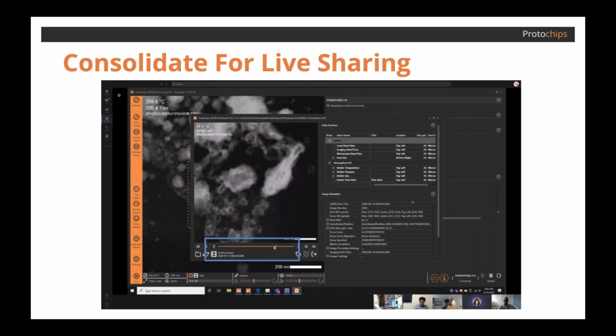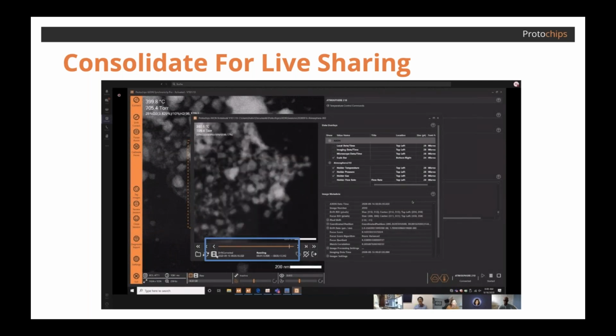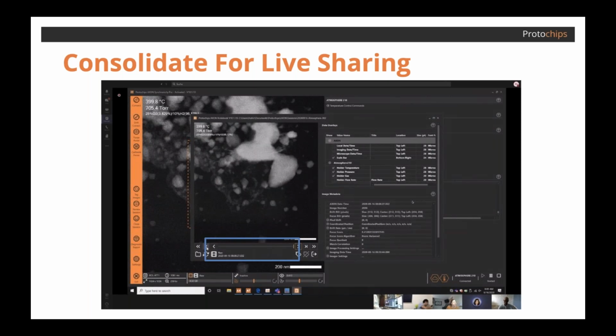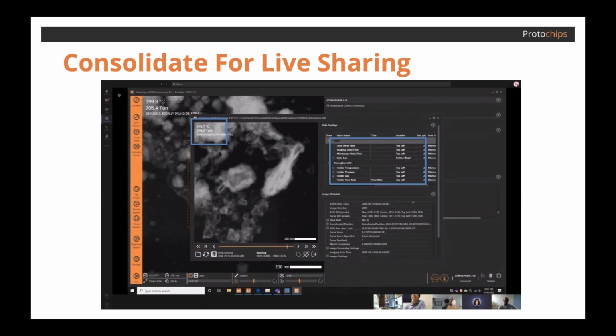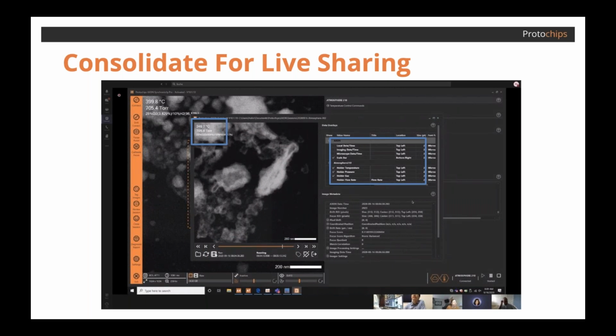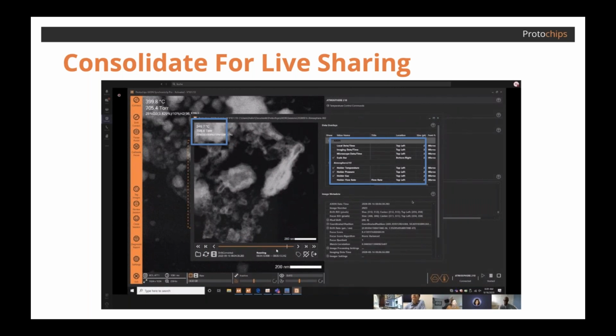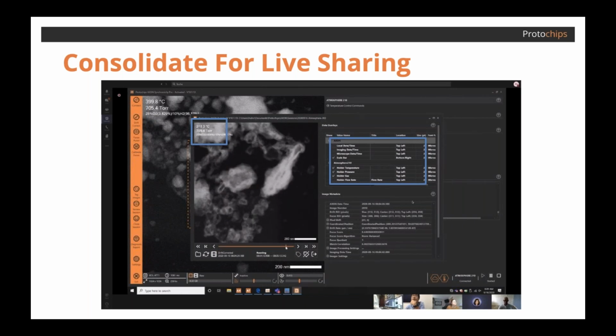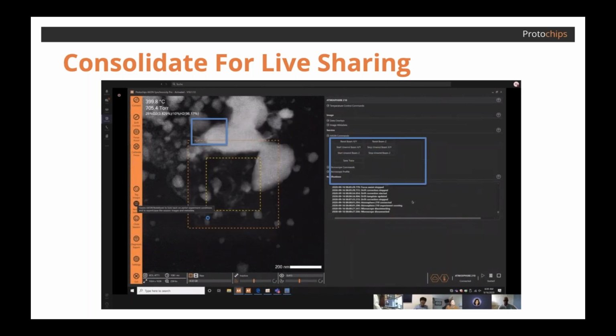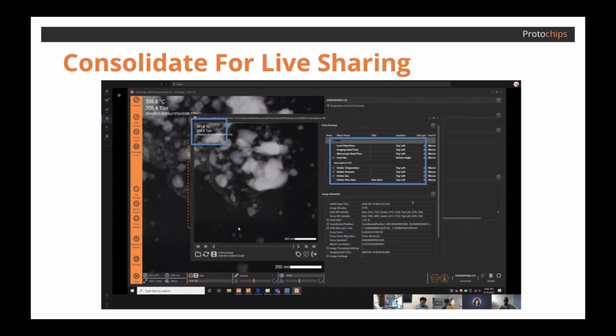You can use the scroll bar to scrub back and forth, reviewing everything from the session as either drift corrected or raw images. And here again, you can add parameter overlays so the audience is aware of the conditions of the data being reviewed. As you can see, they change as you scrub back and forth through the data. So this on-demand review enables the audience to come up with educated answers to questions like, what do you want to do next? Can we end the session or do we need to continue?